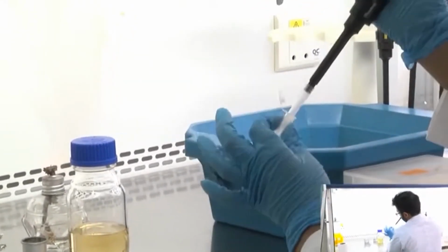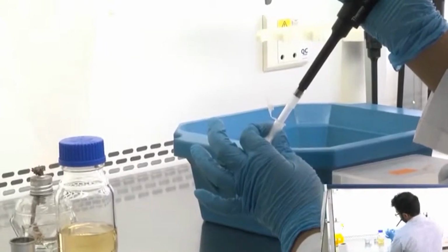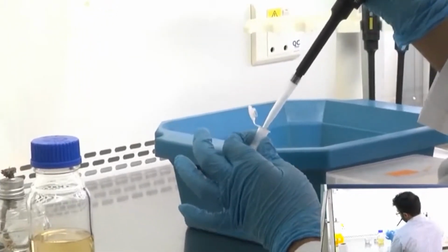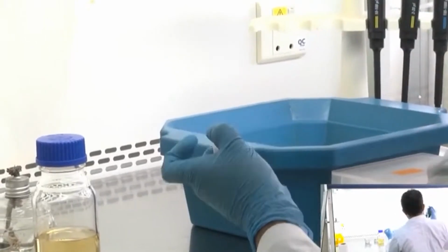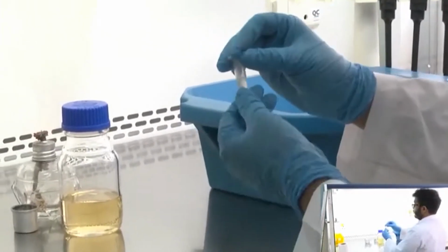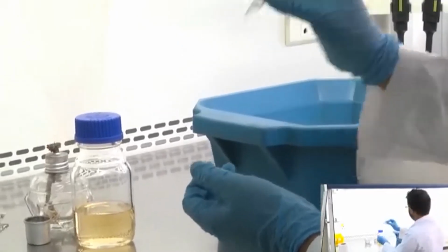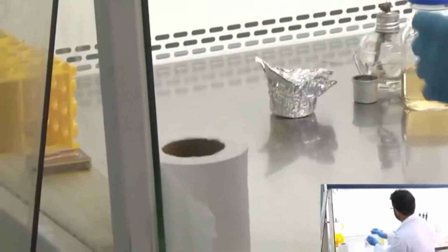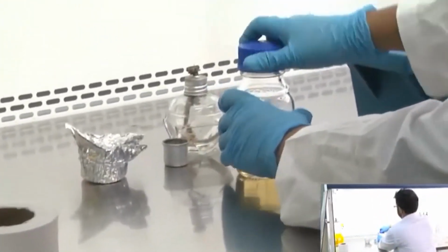I added 450 microliters to the bacterial cells and I am mixing them thoroughly. Next we are going to let them grow at 37 degrees for 1.5 hours. It is no longer mandatory to keep it in ice, you can keep it in a normal centrifuge holder as well.